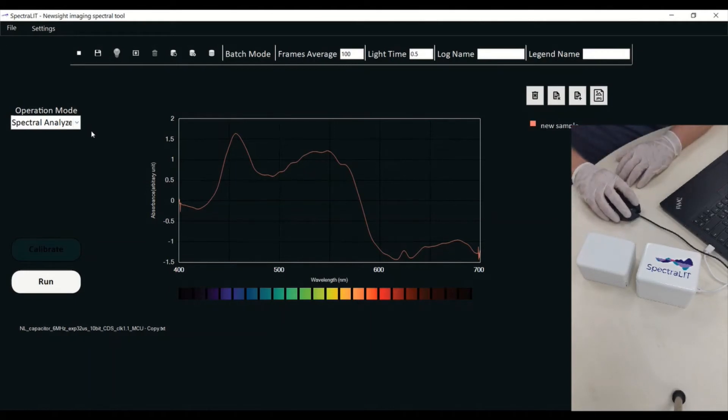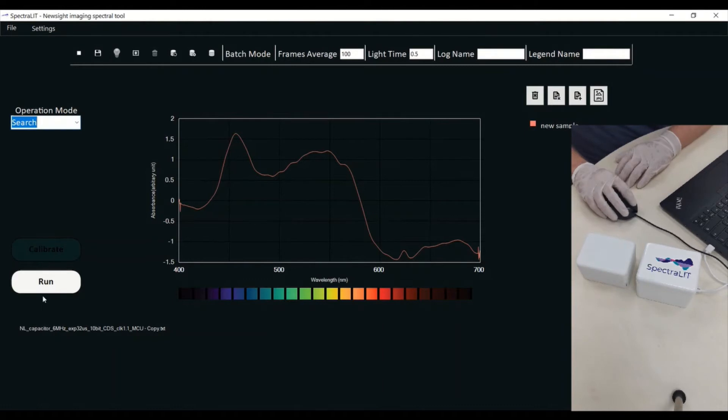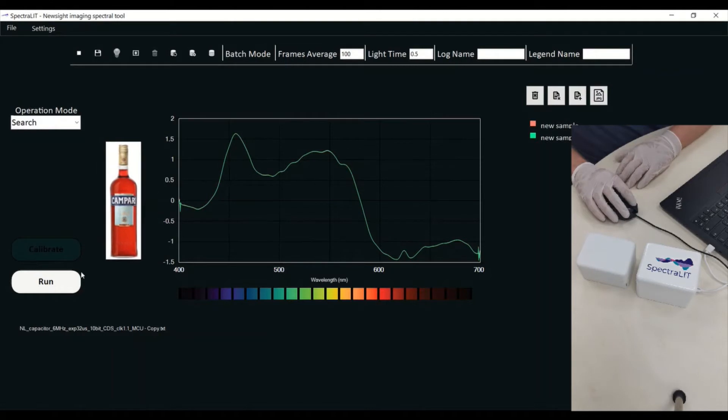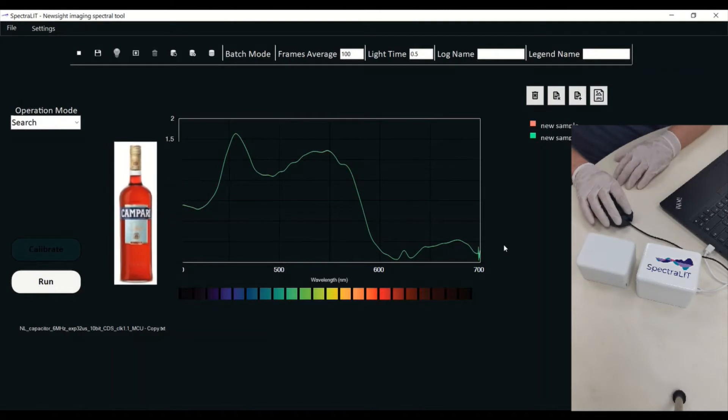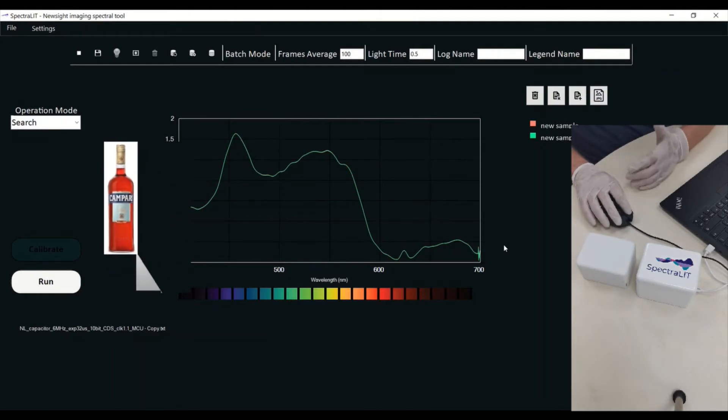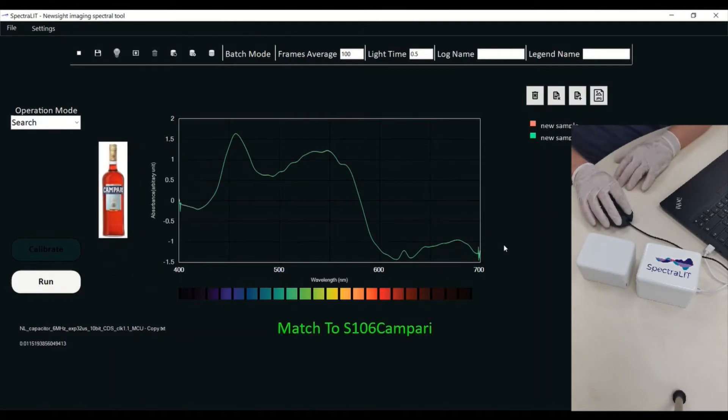So I'm going to do a functional operational mode called Search. I'm pressing Run. While pressing Run, it's going to search the entire database and come up with a substance that matches what I have inside the Spectralit.